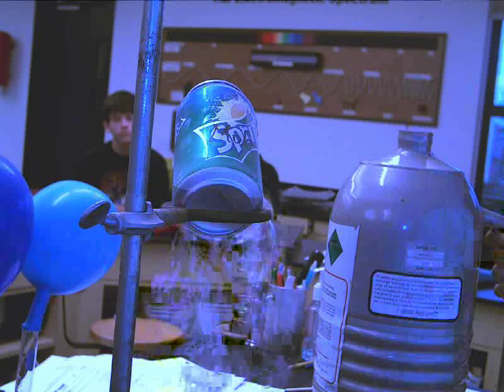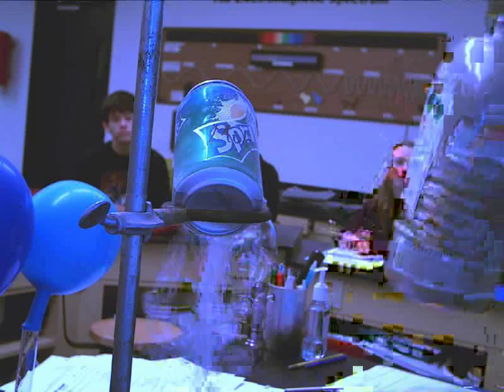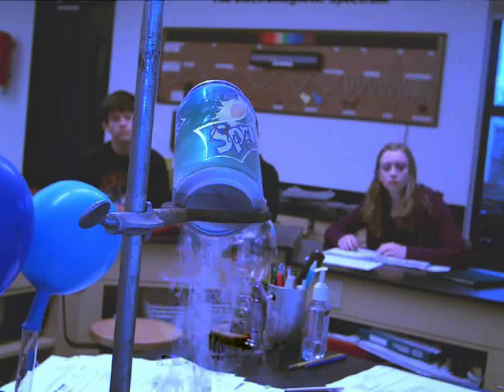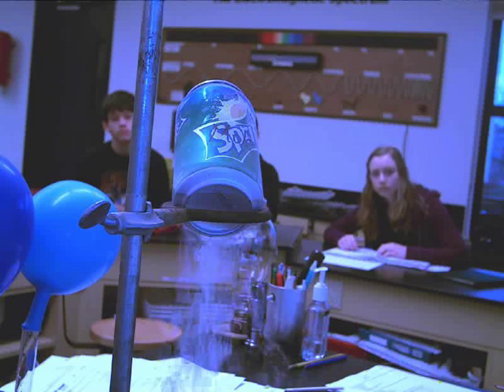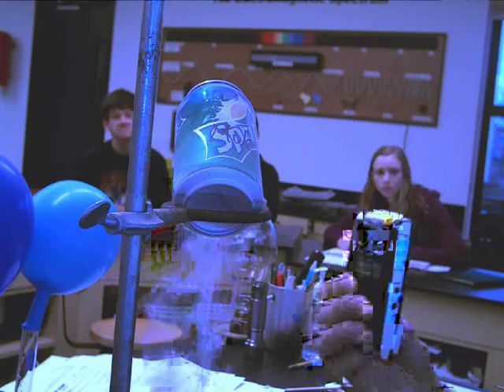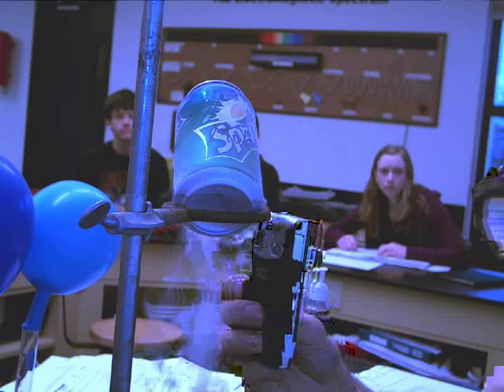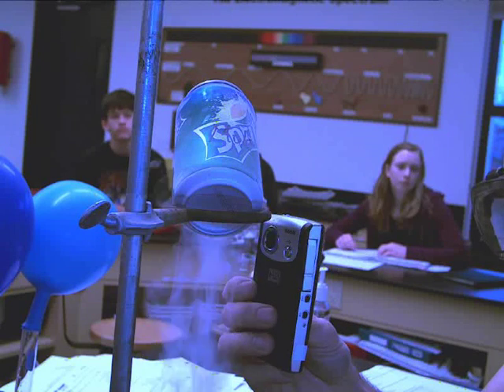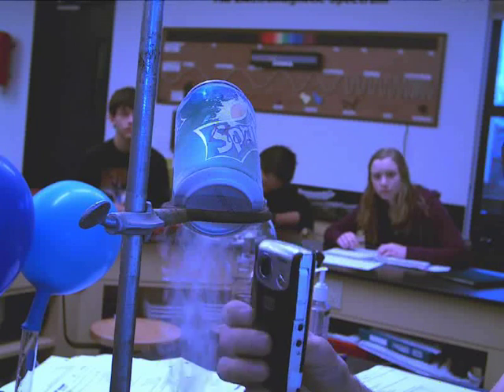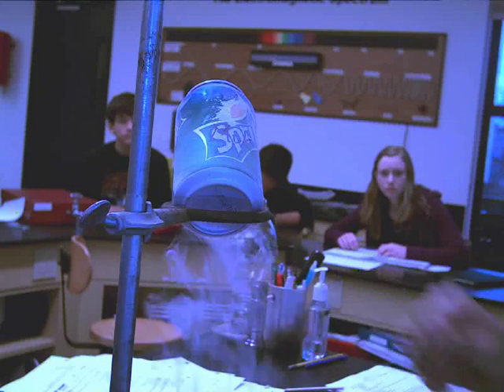See the drops forming right there? What is that? The can is not leaking. That's actually a really good one — I've never seen it so well. See the drops? Where could those drops be coming from? There are drops right on the outside of this can right there.